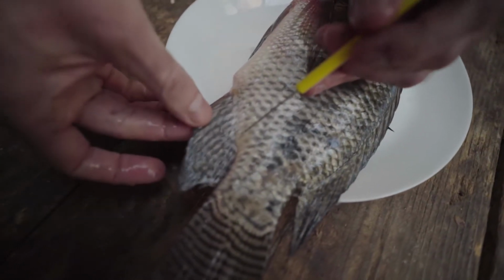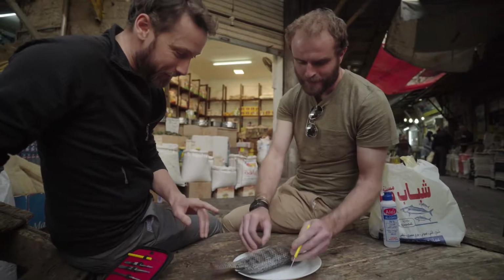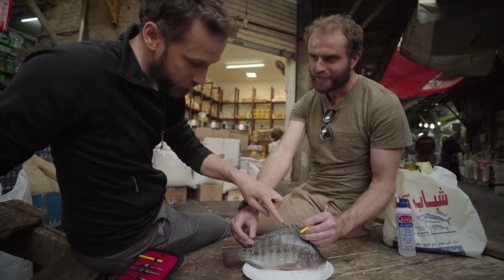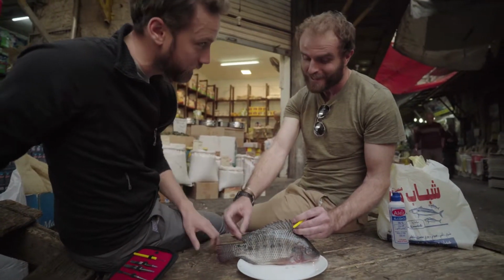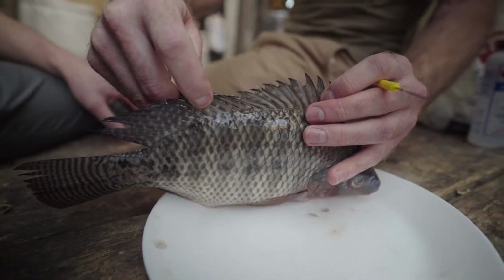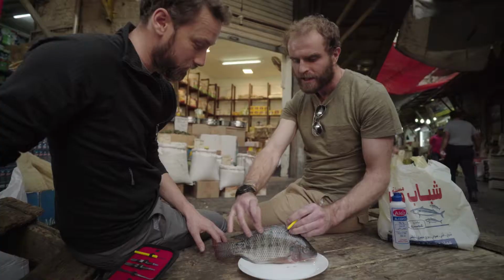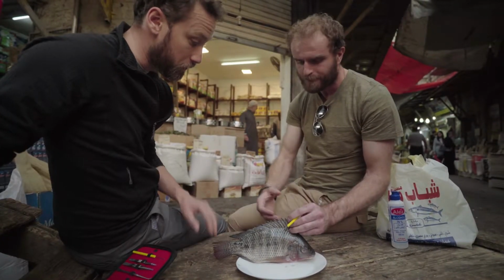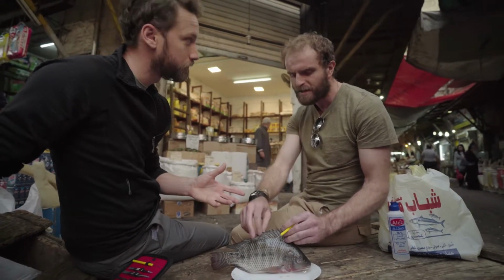Okay, right next to the anus. The anus, exactly. And right up on the top here, we've got our dorsal fin. Ouch, wow. Those are like weapons. Exactly, and that's what they're used for sometimes, for protection. You won't often see them upright like that in the wild. They'll mainly be down like that because if you have them upright, they're not very aerodynamic. So they're just used for protection. Yeah, and a bit of stability too.